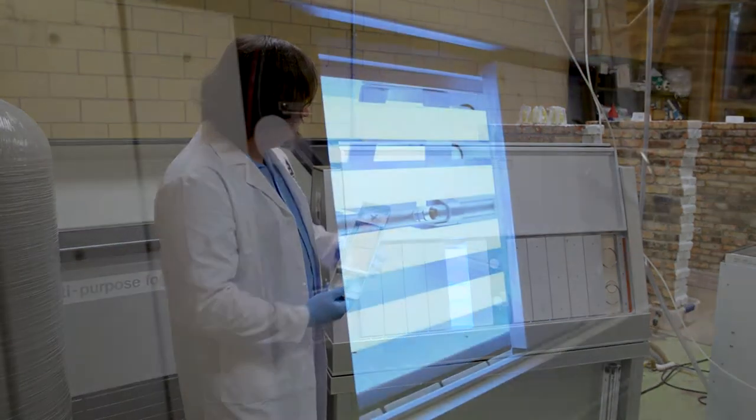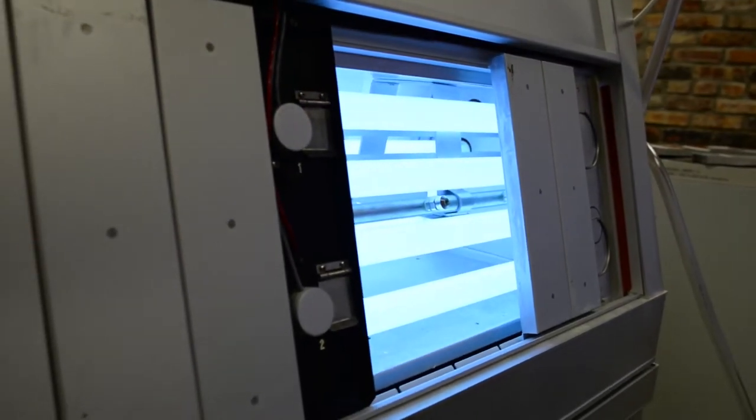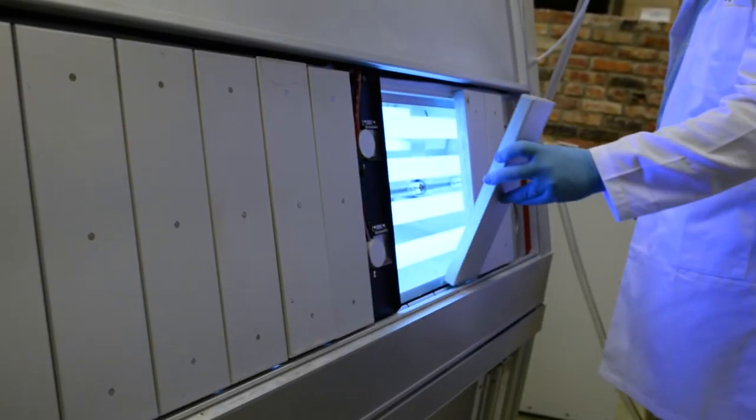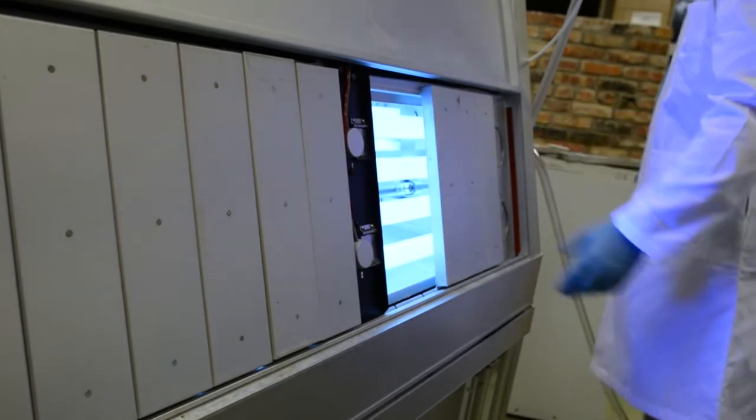The way it works is the QUV has ultraviolet radiation inside it. Essentially it's kind of like a glorified tanning bed. It exposes the samples to light and dark cycles, similar to what they would experience outside, but in a very harsh environment.